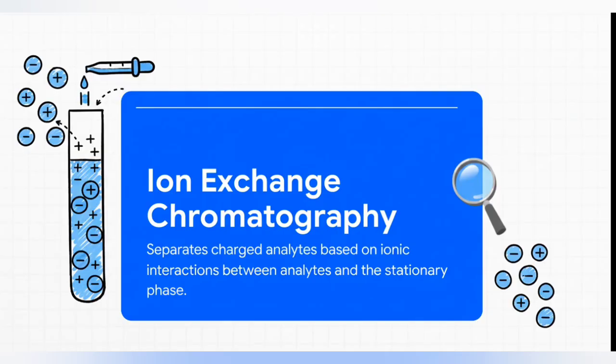And that brings us to the official name, ion exchange chromatography. Now, ionic interactions sound super technical, I know, but it all boils down to a really simple rule we learned as kids. Opposites attract. That's it. It's basically like using tiny, microscopic magnets to sort molecules based on whether they're positive or negative.